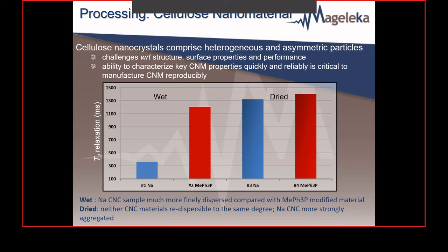So the major advantage again of the magnometer, because it has no moving parts, is that in theory you could do this whole process in one step. You could push it through, dry it, take it out and push it back into the instrument itself. But this just shows again that you can take materials at any stage of a process, in any form, put them in and look at differences between materials to see what exactly has happened.